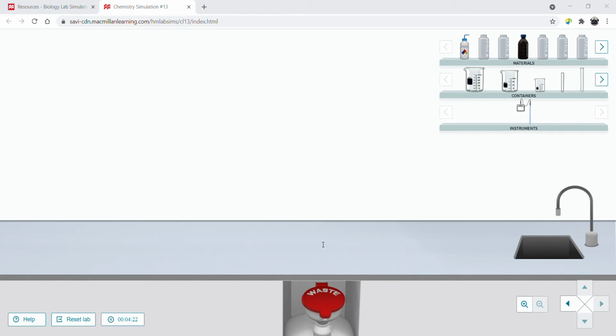Okay, so we're going to set up the first experiment, comparing the pH indicator bromothymol blue versus a good old handy pH meter. We have test tubes 1, 2, and 3. One is going to have water, one's going to have vinegar, and one's going to have ammonia. I'm on page 2 under experiment 1. Take 3 small test tubes, place them on the workbench, label them 1 through 3, and add the reagent to each. Below, record the contents for later.